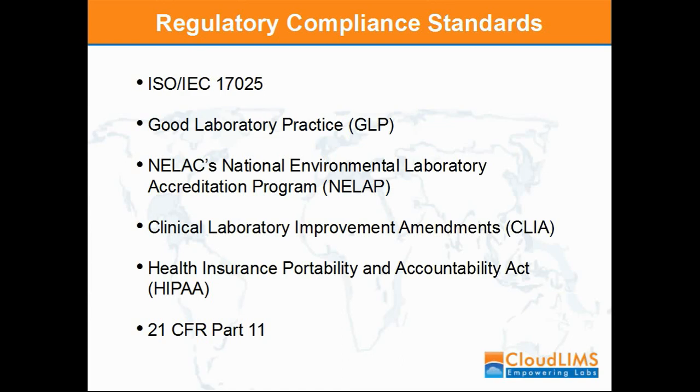The method used for testing should meet the set standards for validation such as accuracy, specificity, calibration, range, limit of detection, and ability to obtain the same or almost the same test results on identical test material under the same conditions. It should happen within a short interval of time and under different conditions as well.